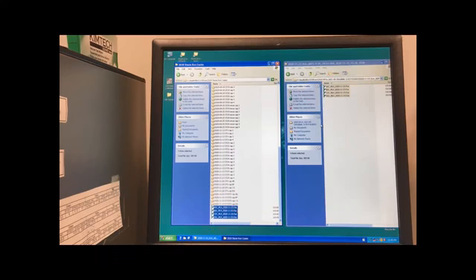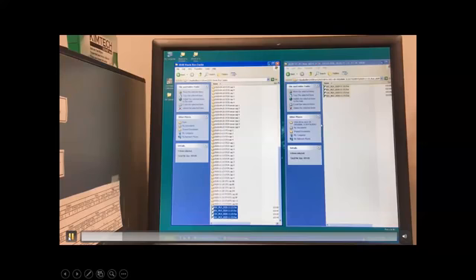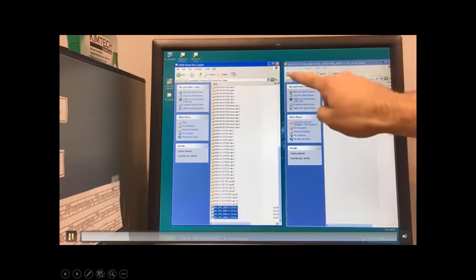The other thing is, notice I'm going to point to it. What you want to do is don't go up. Okay, don't hit this button, because that will take you back to the beginning of the folder. When we hit this back button, notice where we're going to wind up after we go back. Let's watch. Back.